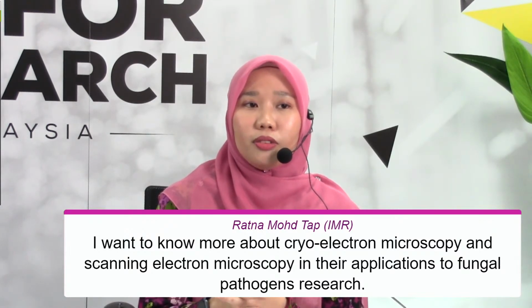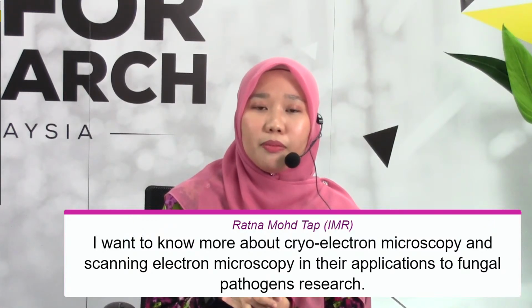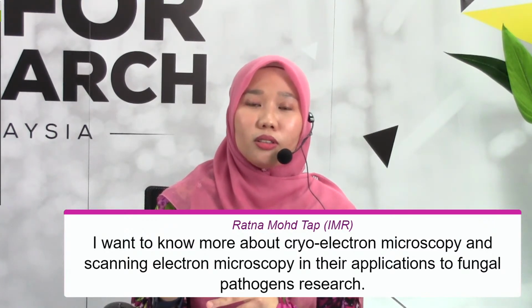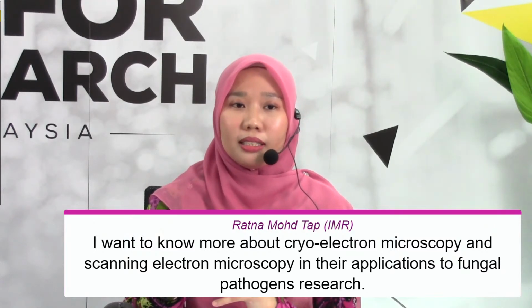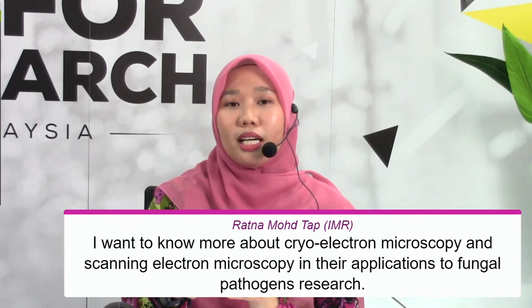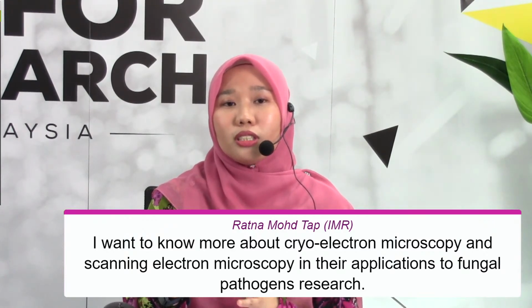And for the SEM, in the application for fungal pathogens, maybe we can see the morphology or the topographical image of the fungal pathogen, which can be seen at a higher level of detail and resolution.